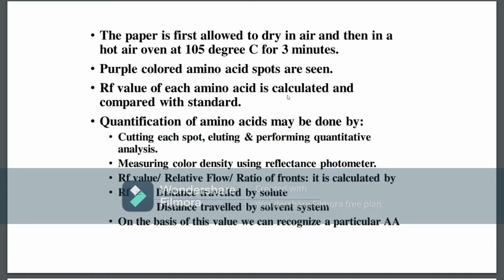Rf value of each amino acid is calculated and compared with the standard. Quantification of amino acids may be done by cutting each spot, eluting and performing the quantitative analysis, measuring color density using a reflectance photometer.